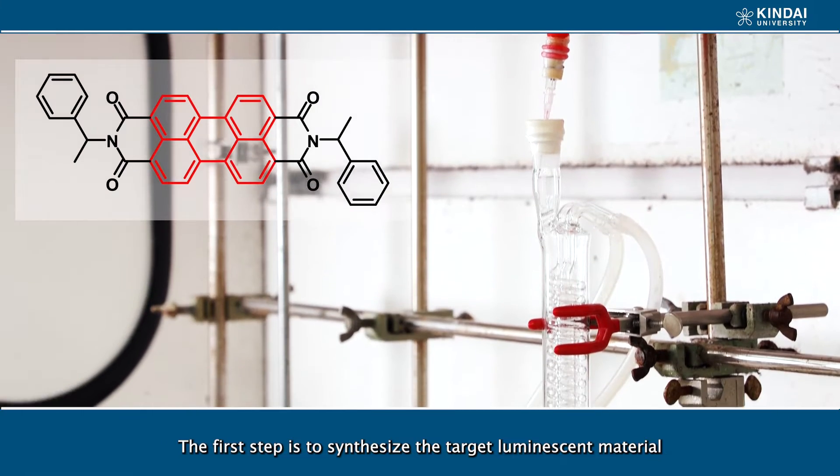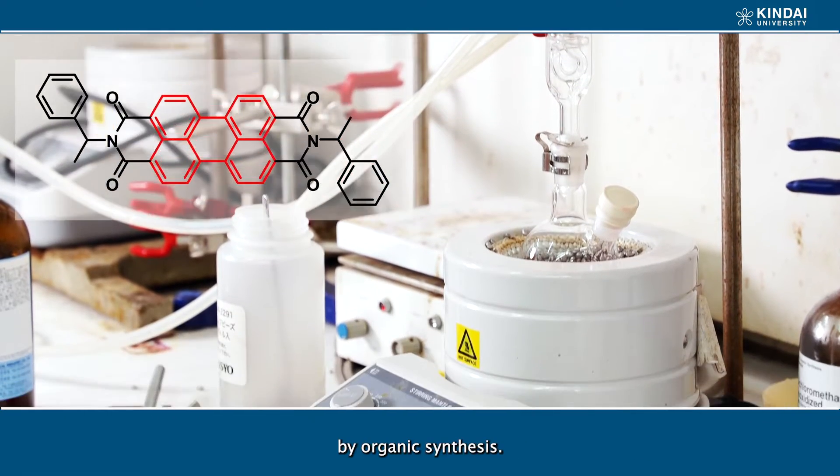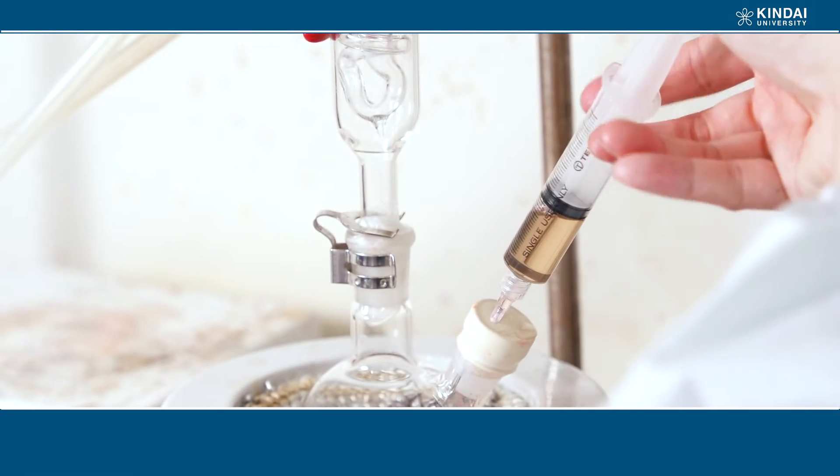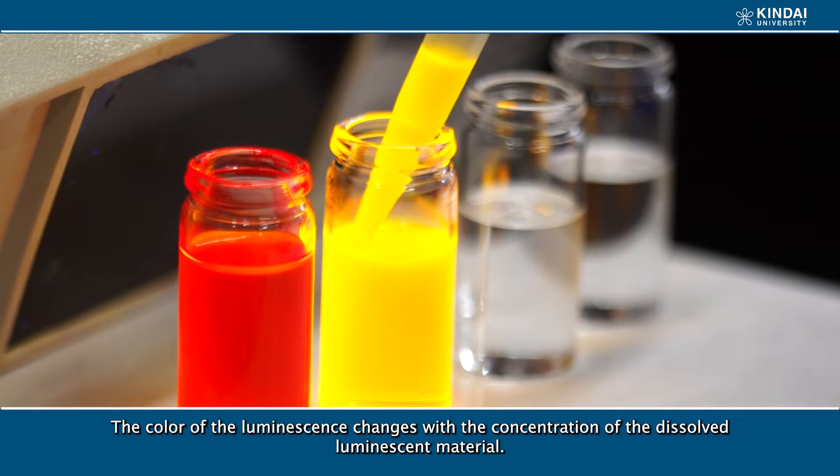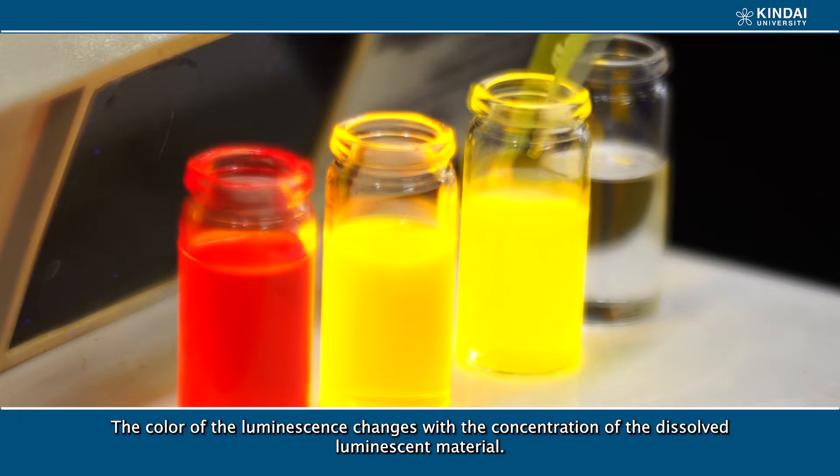The first step is to synthesize the target luminescent material by organic synthesis. The color of the luminescence changes with the concentration of the dissolved luminescent material.